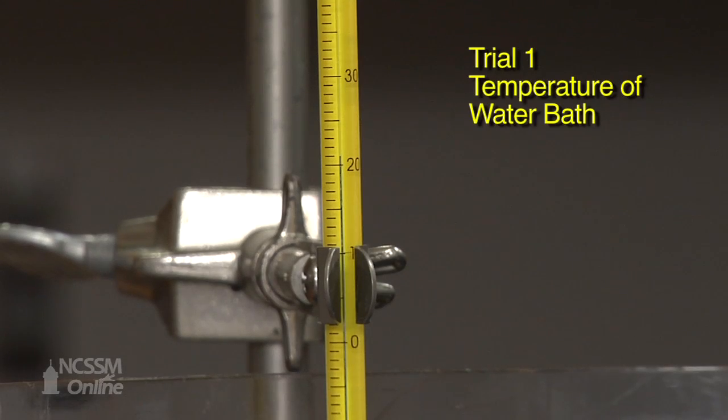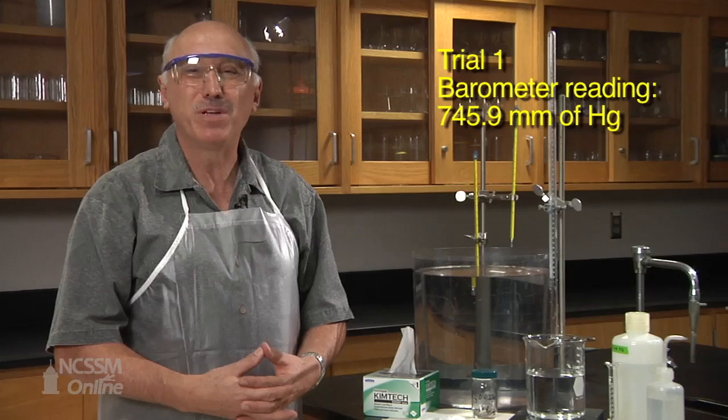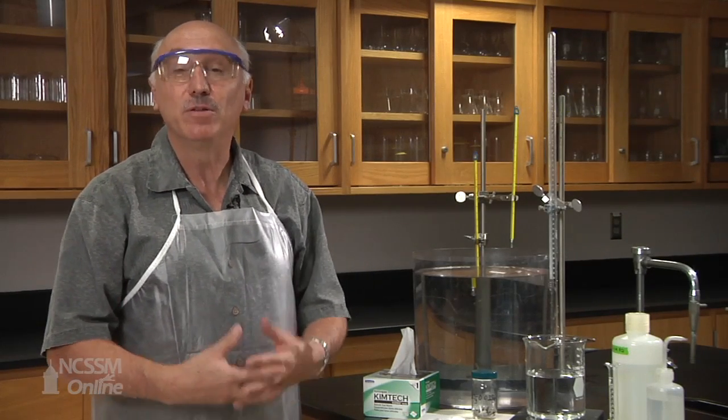Now, this is the water temperature reading, and now this is the room temperature. The atmospheric pressure for trial one is 745.9 millimeters of mercury. Now, we're going to repeat the same experiment two more times.